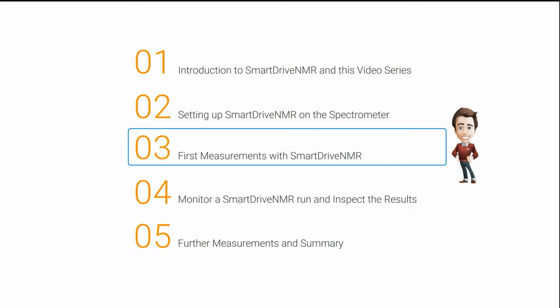Welcome to the third video of this short series of videos about SmartDriveNMR. Now, in this third video, we are all set to do our first measurements with SmartDriveNMR. This is the day-to-day work of John, our routine NMR user.